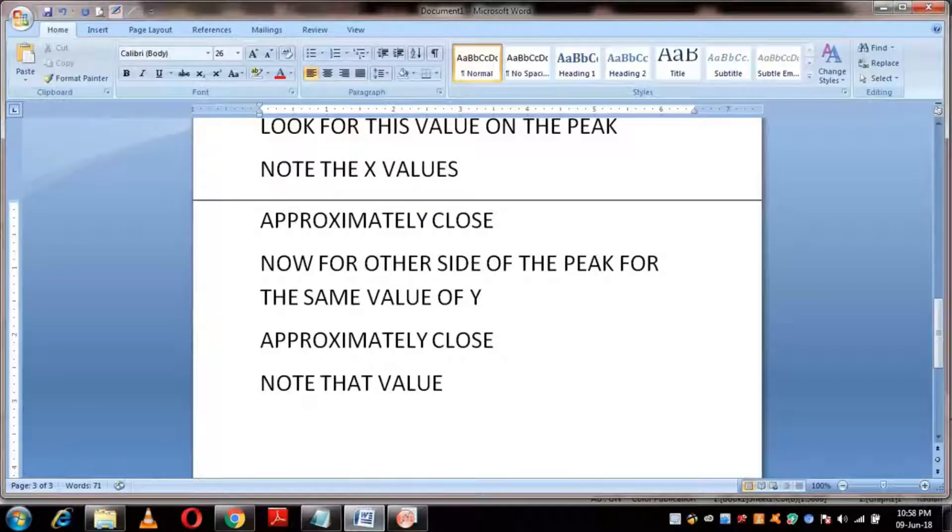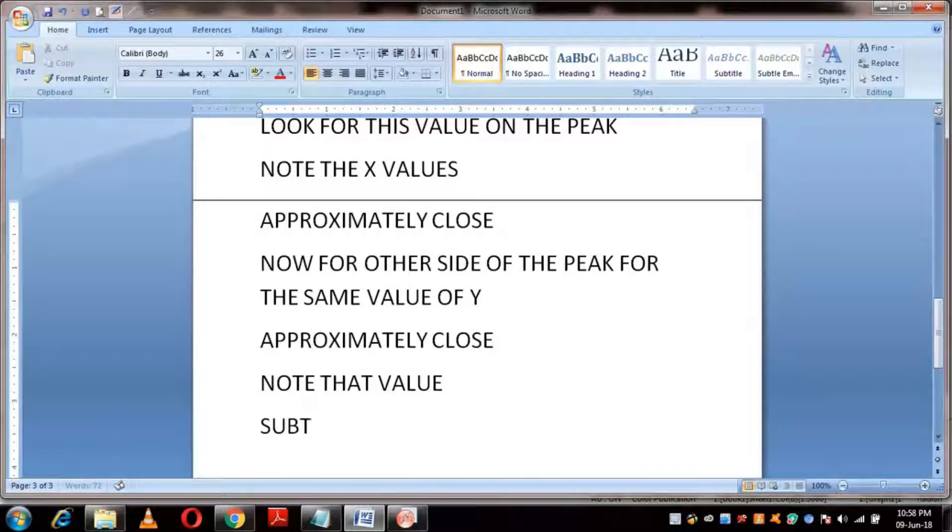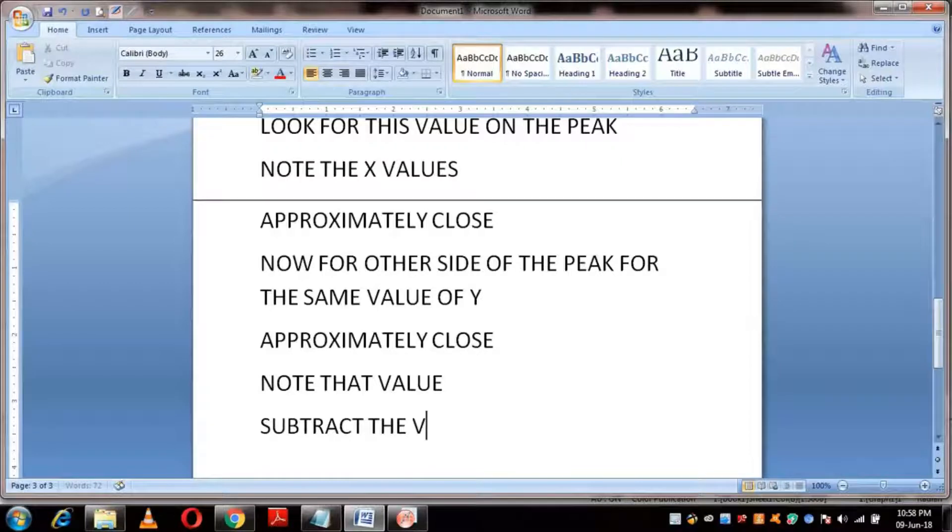Final step: Subtract both values. The result will give the full width at half maximum.